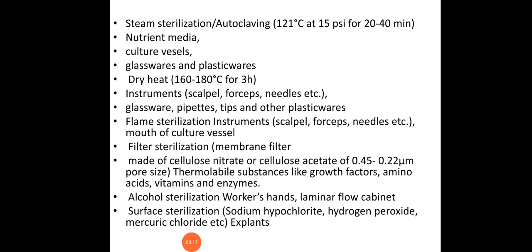the autoclave method. We do sterilization by autoclave. Culture vessels, that is, conical flasks or Erlenmeyer flasks. Then glassware and plasticware. Glasswares are measuring cylinders, petri plates, test tubes, and pipettes. These are the glasswares. Then plasticware.